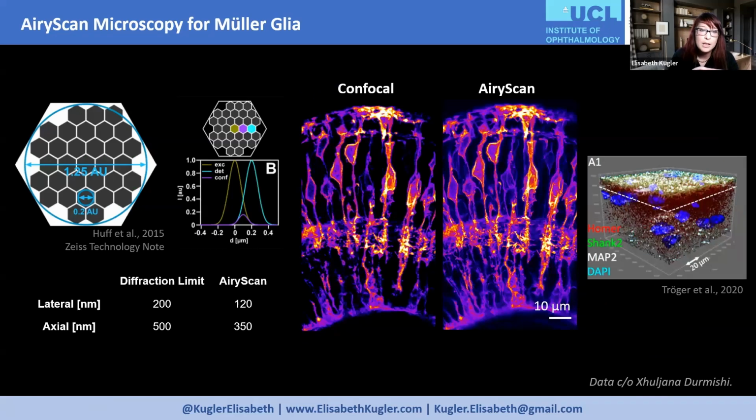And so what we do to study these data is we use AiryScan microscopy. AiryScan is a form of microscopy where we have 32 elements of the detector working together, so we can push beyond the diffraction limit. And that's hugely important because obviously these cell features are very small, especially these subregions that interact with these neurons in this layer called inner plexiform layer.